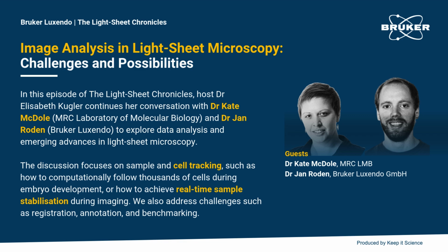It really depends on the further steps of your pipeline, and also, if you have other AI tools in the pipeline, how well can they deal with the artifacts that come from inaccurate registration? Or, as I mentioned earlier, if you want to do multi-view deconvolution in order to sharpen your images, then normally a really accurate fine-grained registration is crucial.